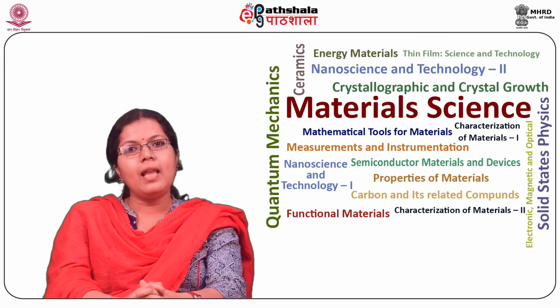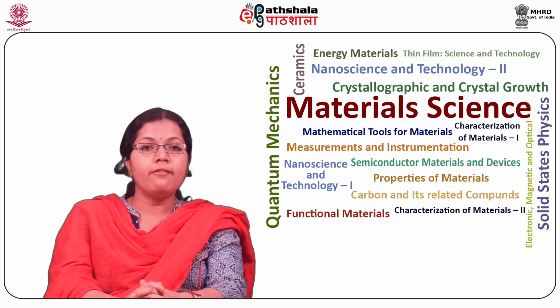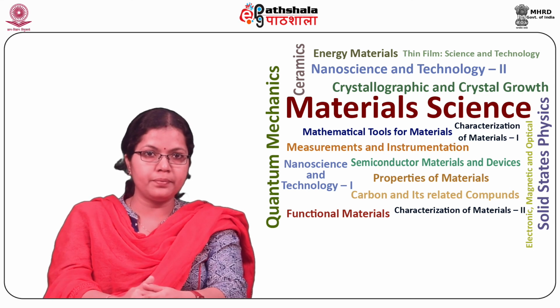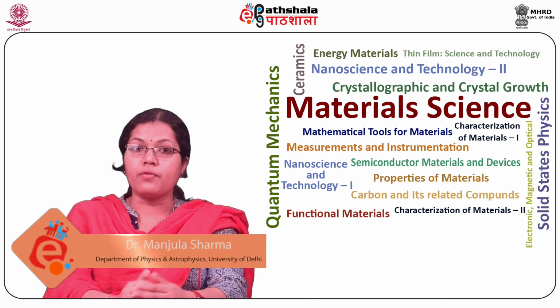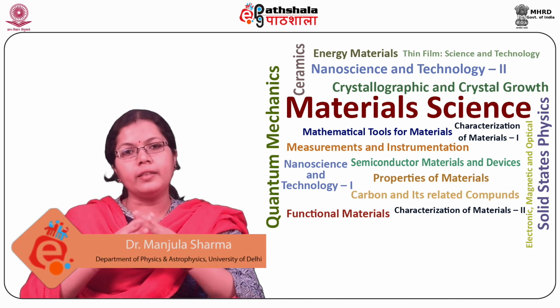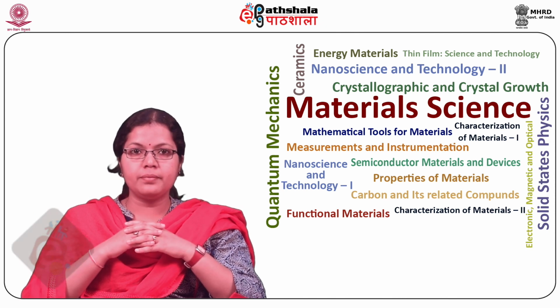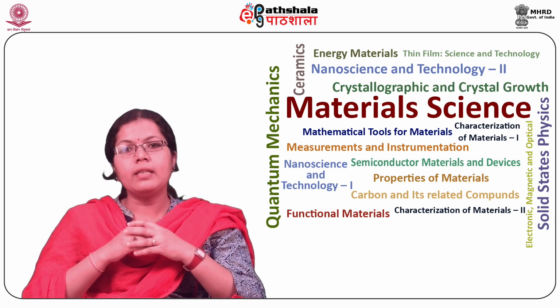So students, let us summarize what we have learned in this module. We have learned about the specimen-electron beam interaction, the emission mechanism and characteristics of signals. We learned about the additional signals present in the TEM. Then we learned about the detectors and the common modes of operation of the TEM.